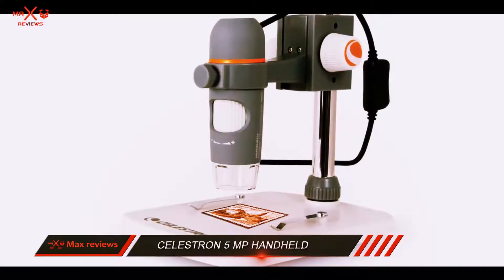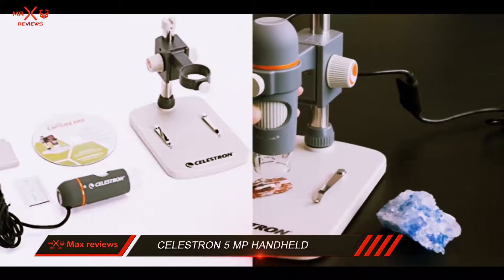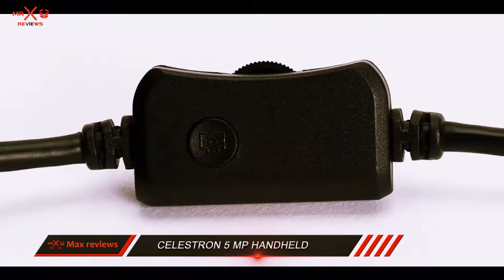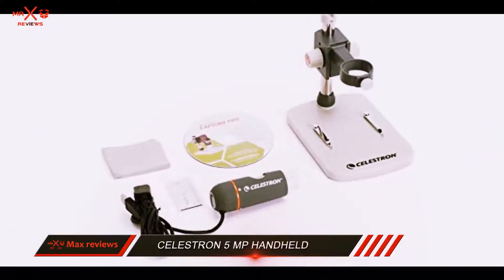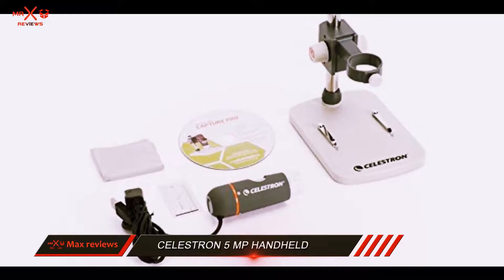The height stand which comes with this microscope is adjustable with the help of knobs. On the surface of this stand, there are two metal clips to hold the desired object in place. It doesn't matter whether you're using this microscope for viewing documents, insects, coins, or any other objects, because thanks to its extensive set of features, the Celestron will come out as a true winner in every such scenario.